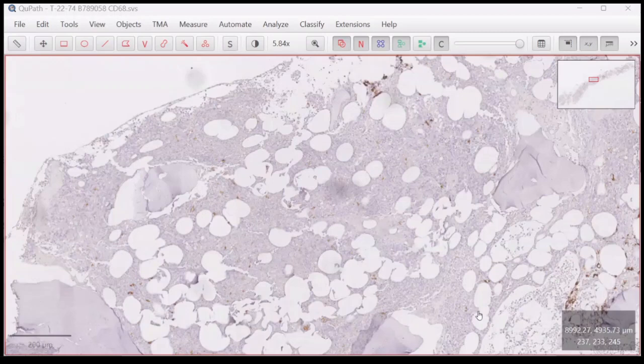But you must remember in CD117, especially when you have CD117 larger or more as compared to CD34, because you can get it in immature regenerating erythroid. You can get it in plasma cells. So in post chemo, post induction marrow, you have erythroid regeneration, isn't it?